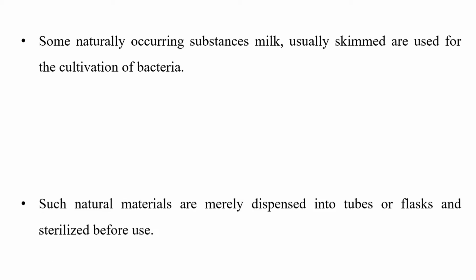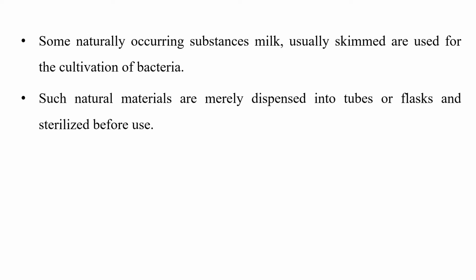Usually, skim milk is mainly used for the cultivation of bacteria. While using a natural medium, we must dispense that natural material into tubes or flasks and sterilize it before use.